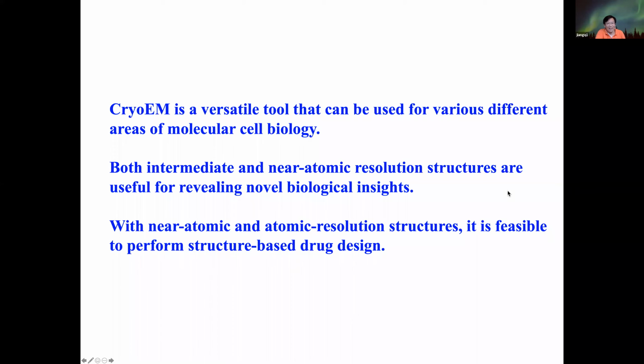With all this, I'm ending this talk. So I have shown you that Cryo-EM is a very useful, very versatile tool, delivering structures in either the intermediate resolution range or at a near atomic resolution. In both resolution ranges, the structural information can be used for revealing important biological insights. And using the near atomic resolution structures, it's feasible to perform structure-based drug design.